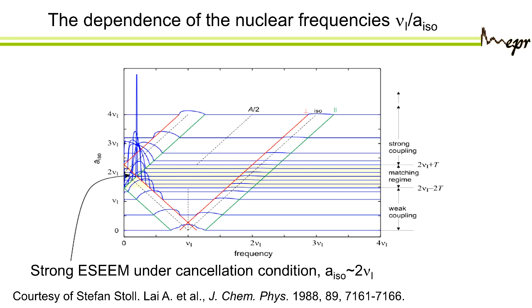Okay, so this is a condition that is easy to measure. Below is the weak coupling regime, the strong coupling regime, and the middle is the matching regime. So what people try to do is, if you have a sample that has a particular hyperfine, you will go and look for the spectrometer where the matching will be close. This is referred to as multi-frequency. So for different hyperfine coupling and Larmor frequency, you have different windows.